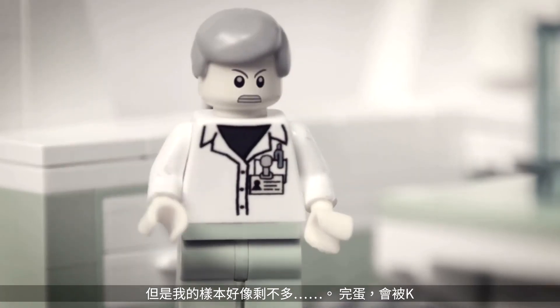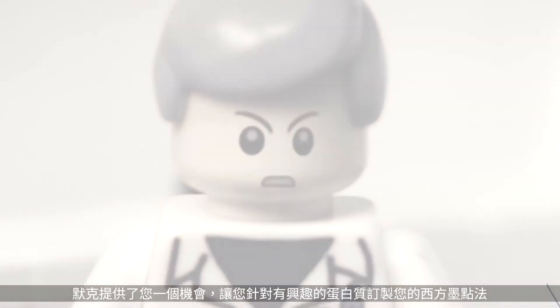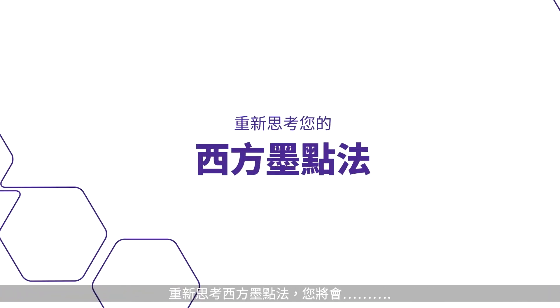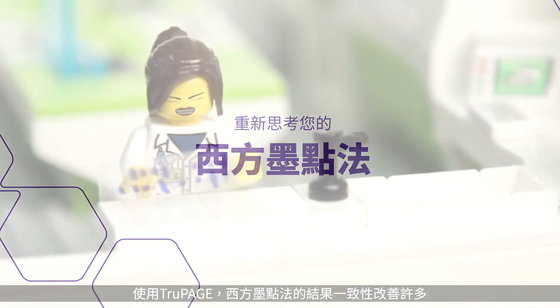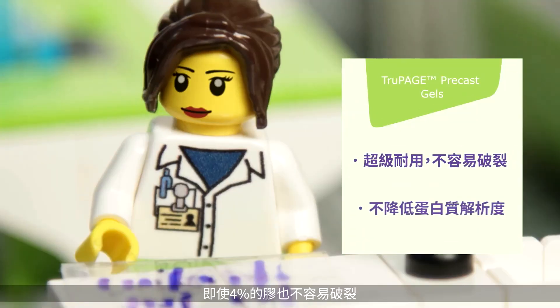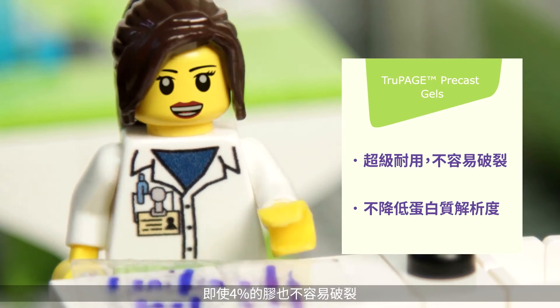What happens when you tailor your Western blotting protocol to suit your protein of interest and your lifestyle? Here's what you gain when you rethink Western blotting. I get so much more consistency when I use a TruPage precast gel — even my 4% gels don't break when I hold them.